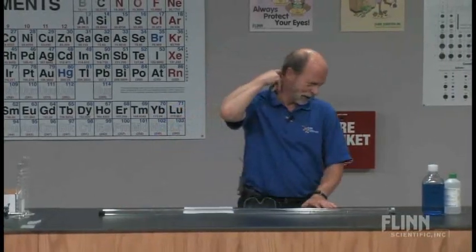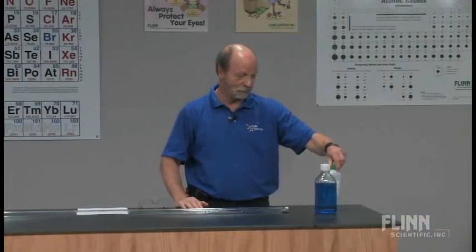The first demonstration that I'm going to do is one involving two different liquids, one of which is water, and the other is ethanol, an alcohol, ethyl alcohol. Students, by the time they reach chemistry, have probably heard about ethyl alcohol, but they probably haven't seen it, and I'm certain they haven't come in contact with it. There's a bridge that I almost bought way back when I lived in Brooklyn growing up, but anyway.